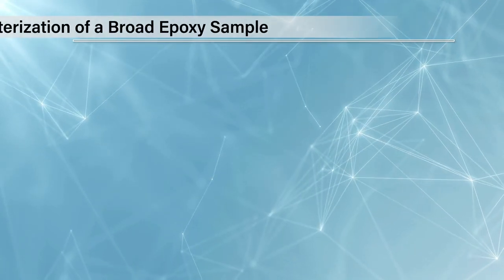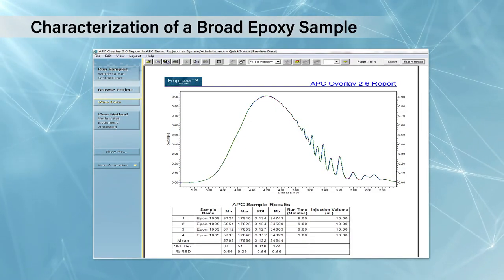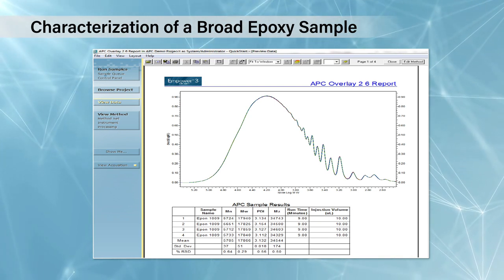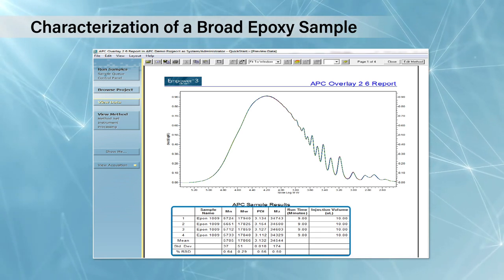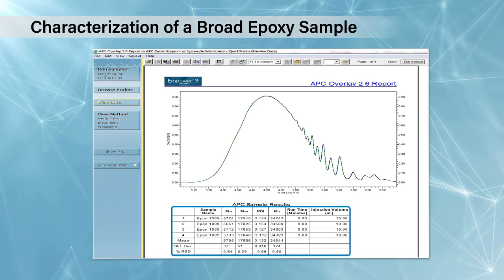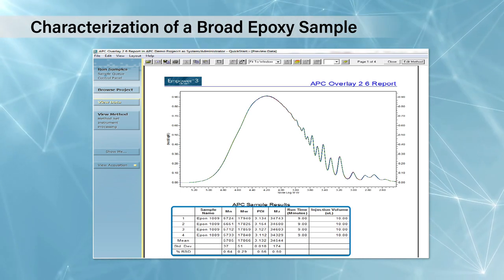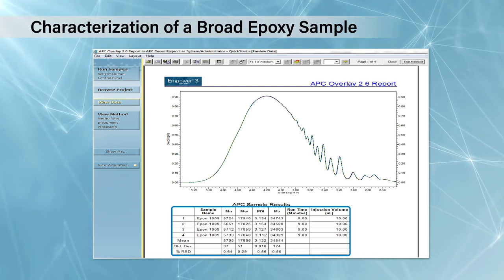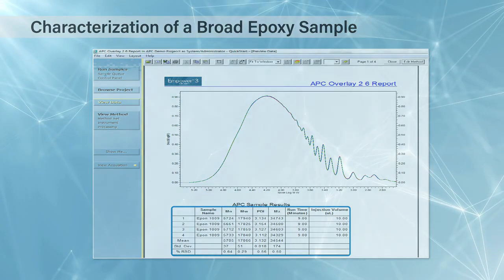So when you look at the overlays of the data, and this is something which the APC excels at, the reproducibility of the data. You can see we've highlighted a lot of replicates here, and you can run a report which will run all the statistics over the reproducibility, again to give you confidence that your method is correct, that you aren't seeing some deviations either due to some kind of unexpected system fault or more likely non-optimal method.